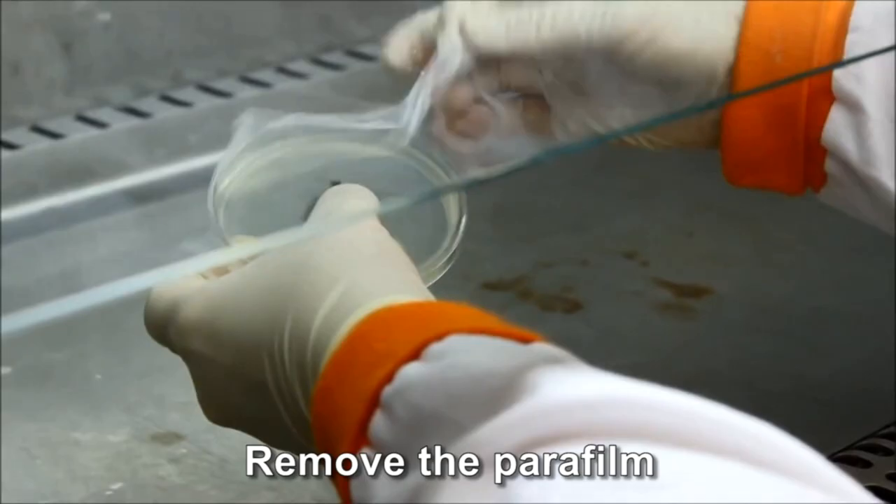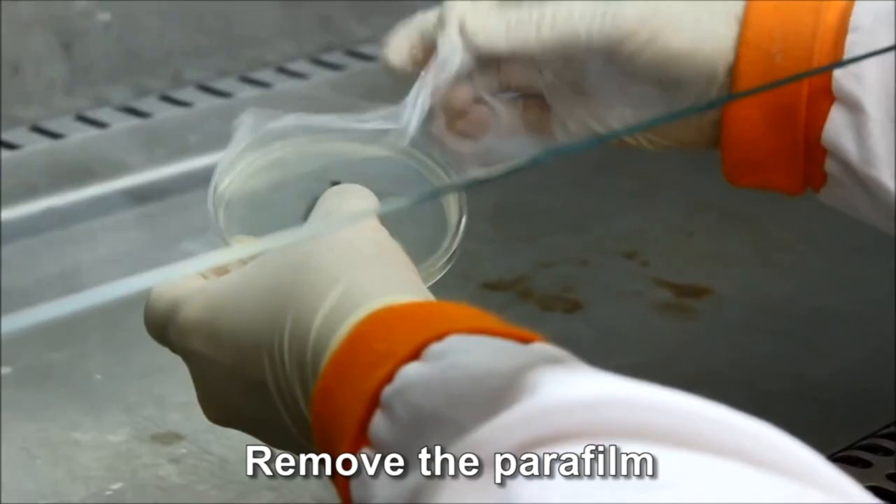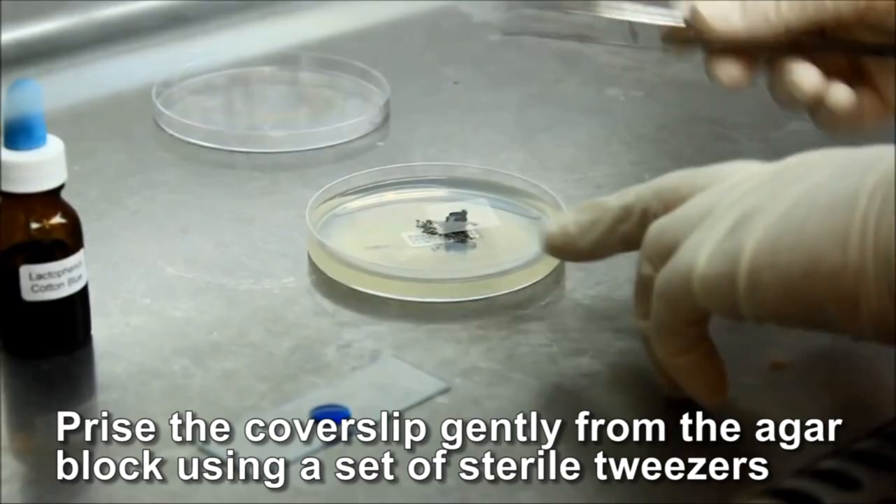Remove the parafilm from the plate and dispose of it into the appropriate waste container.